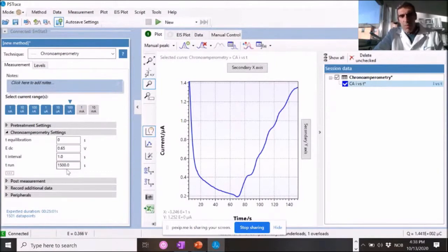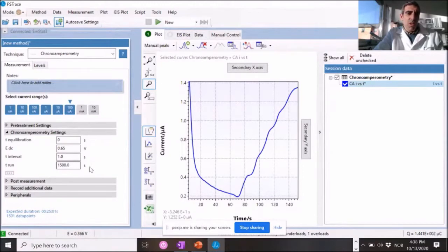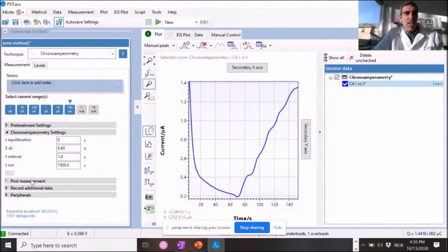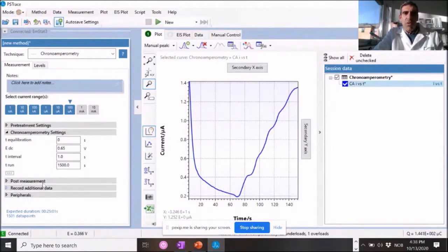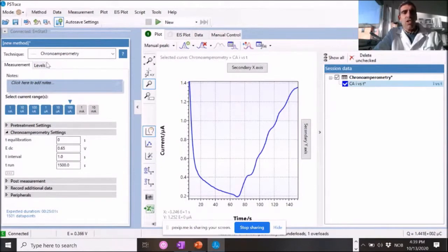And I'm running a potential of 650 millivolts at a sampling rate of one second. And I run it, for example, here, I'm going to run it for 1500 seconds, not necessarily, but it's just to put some time during the time you want to have the measurement.